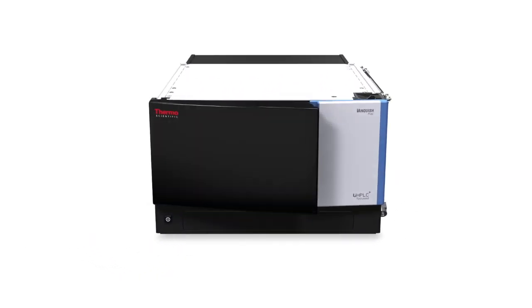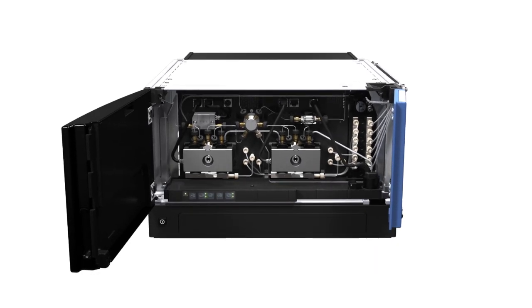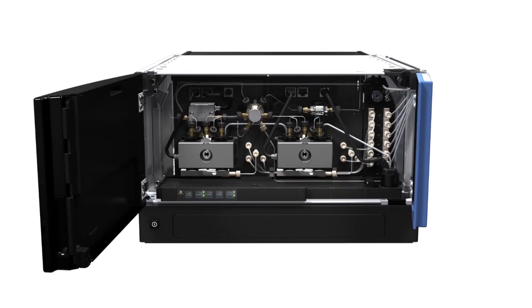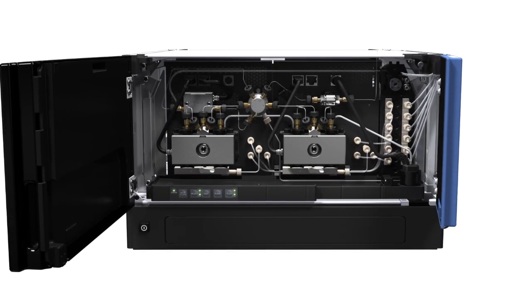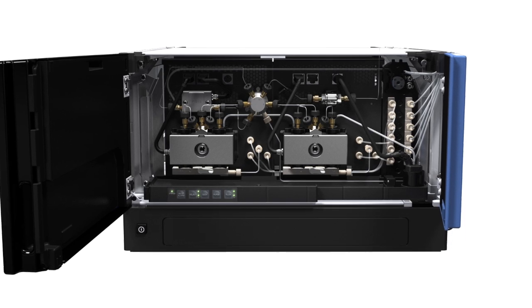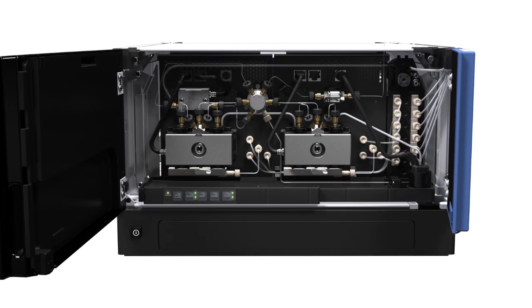Driving the separation is the Vanquish pump, delivering a pump pressure of 1500 bar — that's 22,000 psi — without compromising durability and robustness. It can deliver flow rates up to 5 millilitres per minute and has the availability of two 3-solvent channels for method development flexibility.